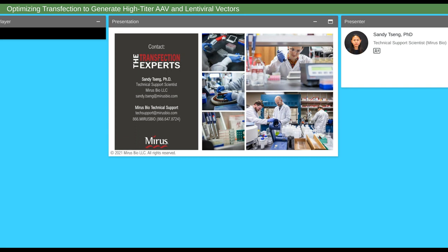Yeah, sure. Happy to explain that. So I'm not quite sure where you saw the 1:1, but I think you're talking about the microliter of reagent to DNA ratio. And this is going to vary by what experimental system you're using and packaging mix, things like that. But essentially the general range that we came up with for our protocols is based on the amount of reagent that you can think of as a concentration that is provided. And so actually the ratio that we'd recommend working with first is closer to the range of 2:1 to 3:1.